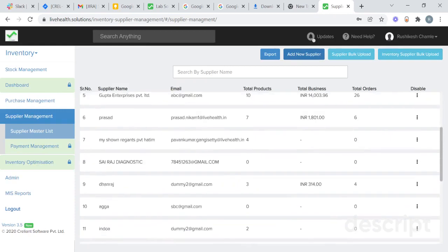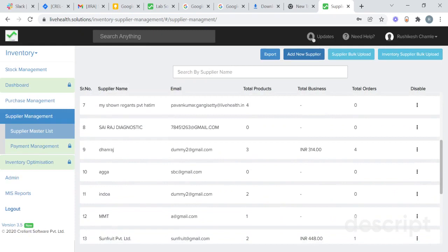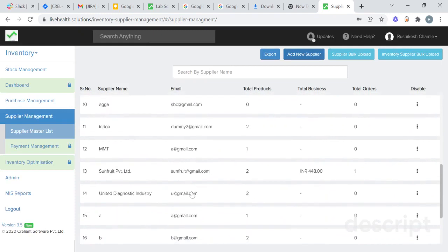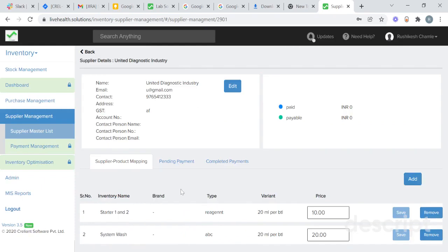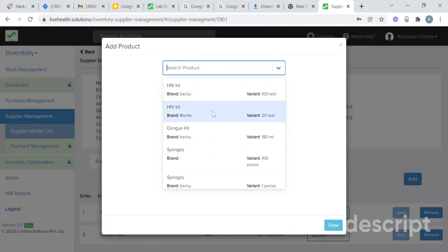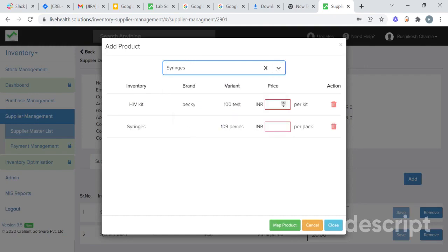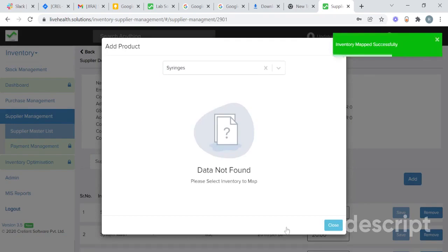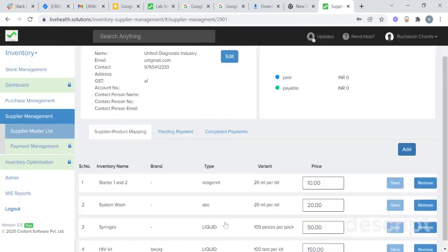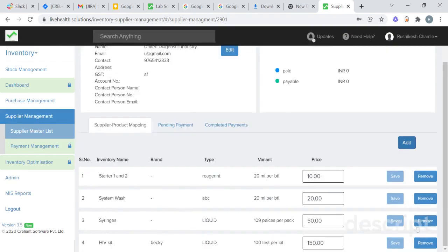When you add a new supplier, you will need to map a product with that particular supplier. To map the product, click on the supplier you want to map. Go to supplier product mapping and click on add. Select the product you want to map — suppose I want to map HIV kit and syringes. Add their quoted prices and click on map products. We have now mapped two products with this supplier. You will also be able to remove the mapping.